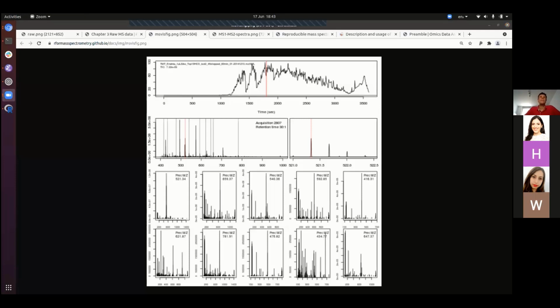But now if you look carefully at that figure, you should be wondering that some of the most intense peaks, and certainly the 2 or 3 most intense peaks in this MS1 scan here, haven't been selected, right? Here is a very intense peak, here is a very intense peak, here's a very intense peak. These peaks here have not been selected. And so you might wonder why.